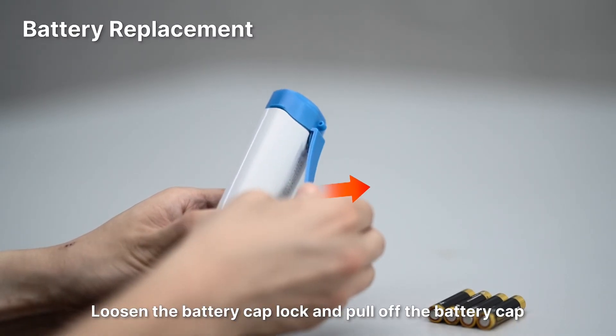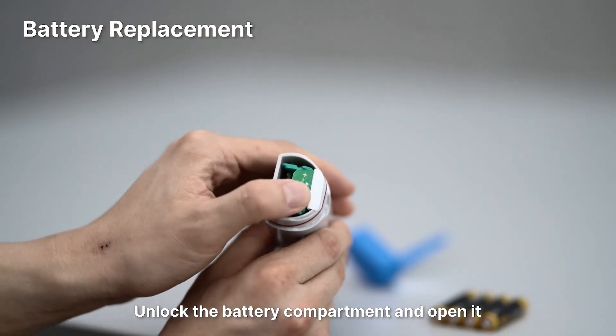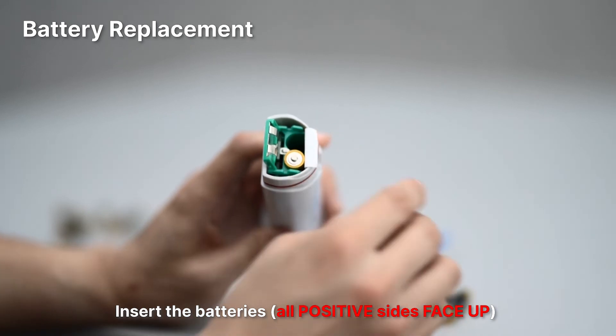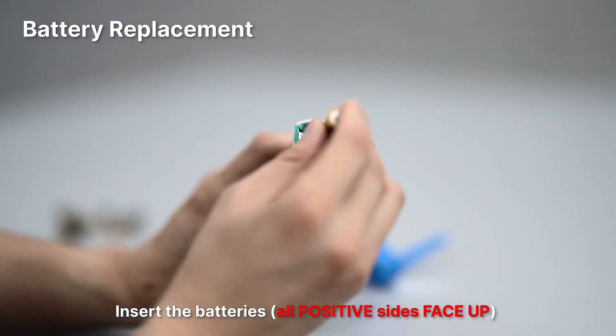Battery replacement: Loosen the battery cap lock and pull it off. Unlock the battery compartment and open it. Insert the batteries — all positive sides must face up. Press down and lock the battery compartment.